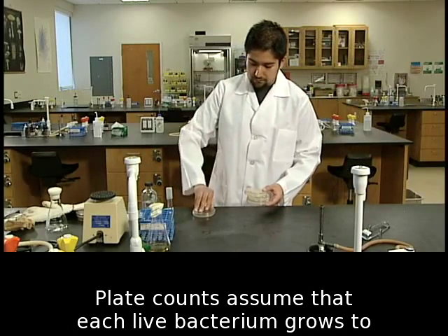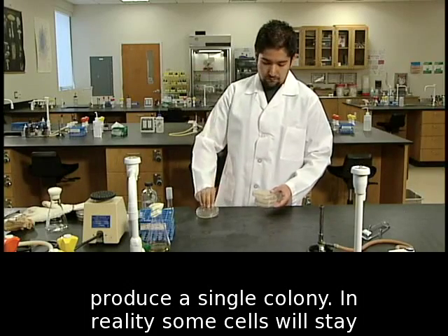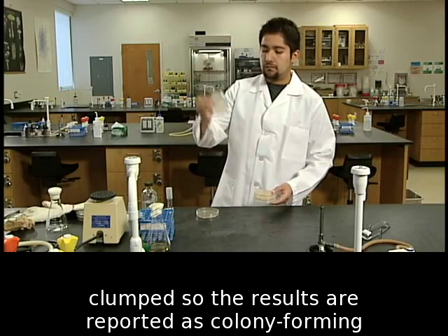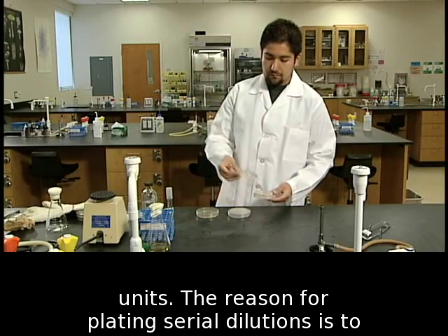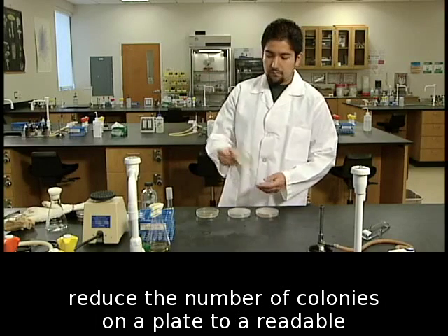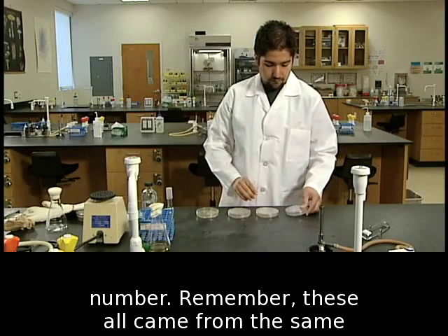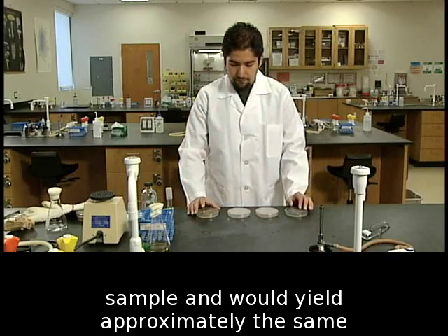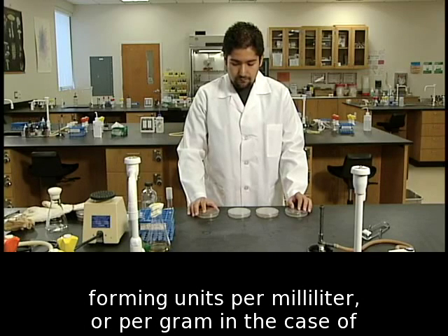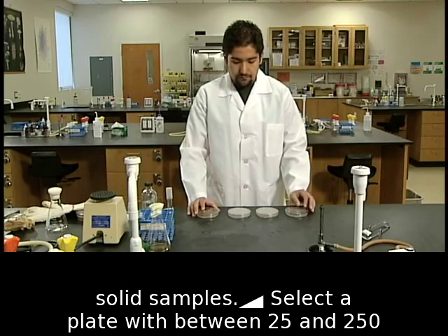Plate counts assume that each live bacterium grows to produce a single colony. In reality, some cells will stay clumped, so the results are reported as colony-forming units. The reason for plating serial dilutions is to reduce the number of colonies on a plate to a readable number. Remember, these all came from the same sample and would yield approximately the same number of colonies if you could count all the colony-forming units per milliliter, or per gram in the case of solid samples.